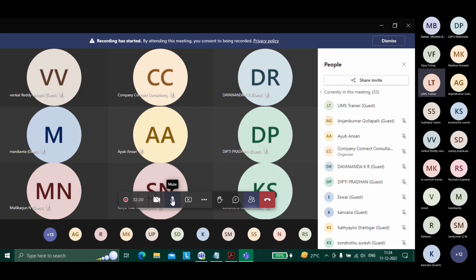Yes. For example, you can say workflow is also a separate module in LabWare. So there are menus and sub-menus, right? Each module is arranged in the form of menus and sub-menus. Every software has modules, and each is designed to do one specific kind of procedure. In the later sessions we'll surely dive deep into what each module is, so no need to worry.